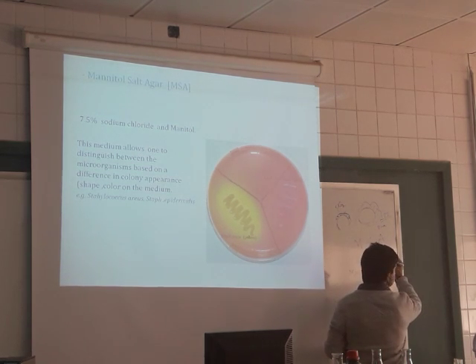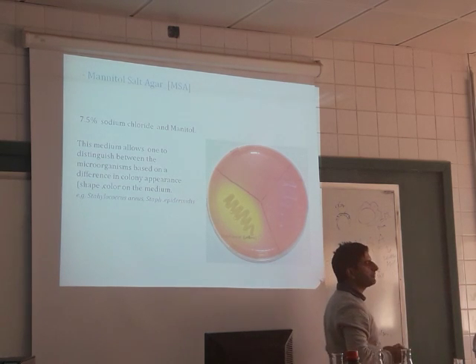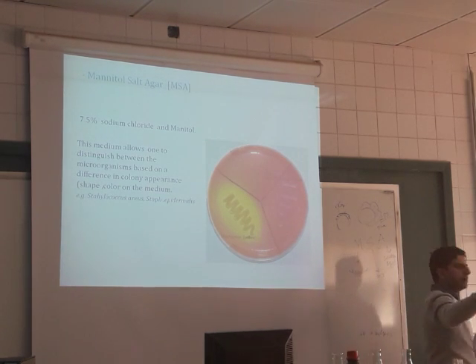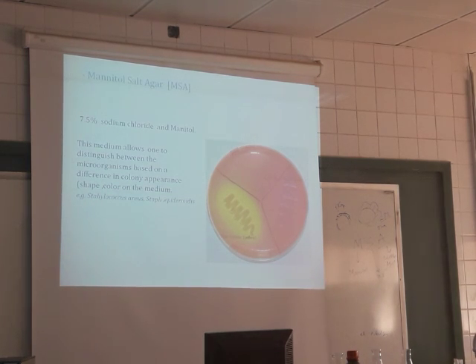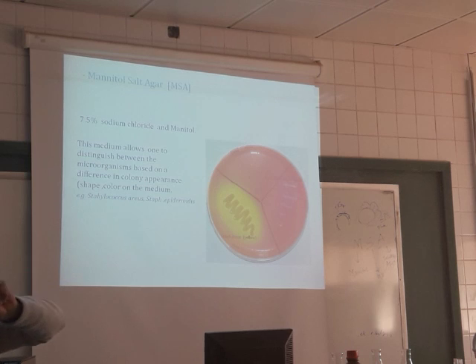Agar is agar. What is agar? A solidifying agent. MacConkey agar, nutrient agar, mannitol salt agar: agar is only a solidifying agent and has no other role. Okay? You see in the mannitol salt agar, I have written two points. It contains sugar, mannitol, and salt.